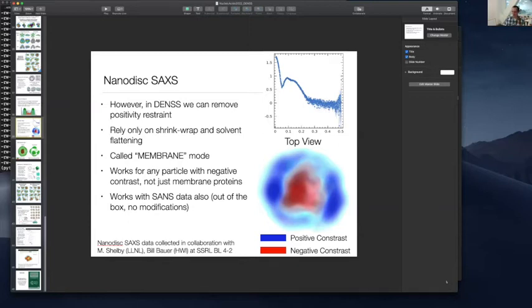I don't remember. I think it might also be interesting, if you have it, to try Cryptococcus, because its capsule is so large. Streptococcus was one of them, and it gave capsules. Well, I was talking about Cryptococcus. It's a fungal pathogen. Oh, okay, cool. Yeah, if you have data.